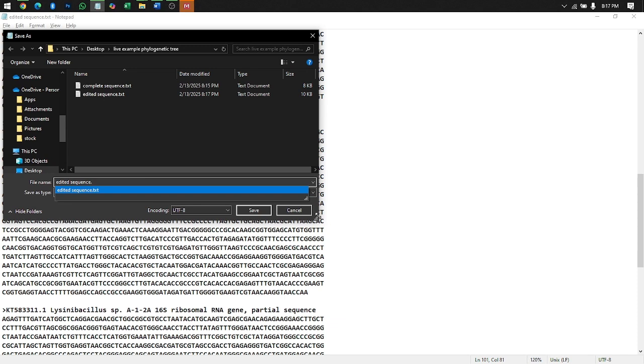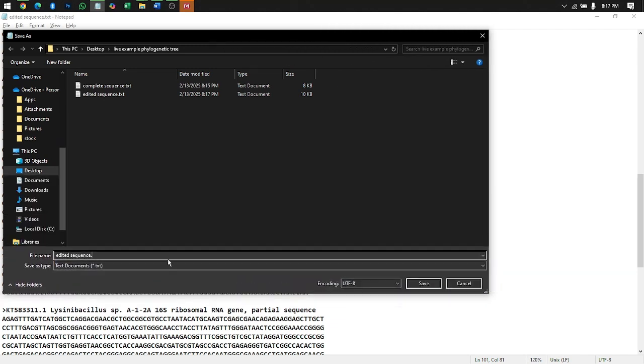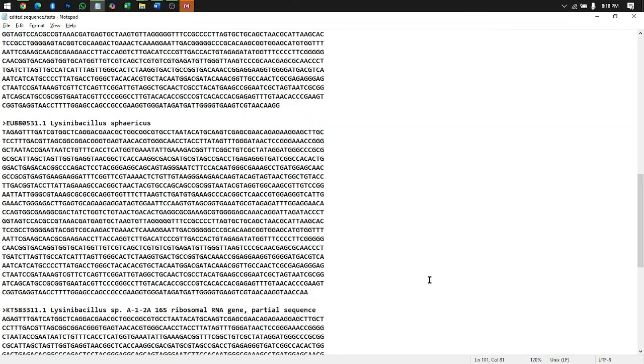Okay, there was txt here like this. You cancel it and change it to FASTA. It's called FASTA format. This FASTA format is the format that is readable by the MEGA software. The file format is just like we have document format, PDF format.